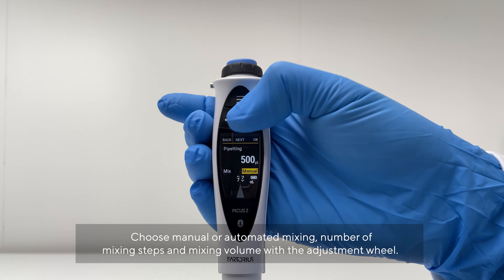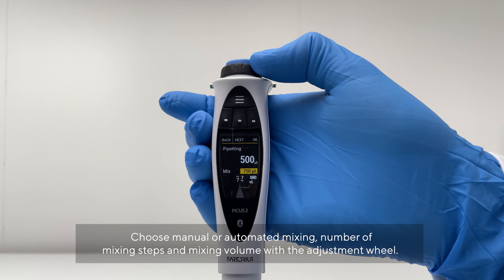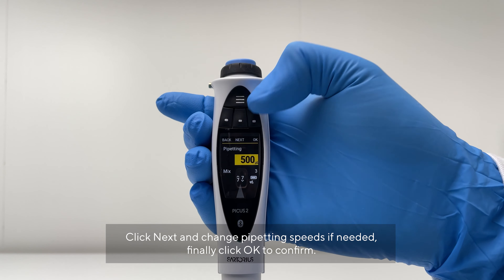Choose manual or automated mixing, the number of mixing steps, and mixing volume using the adjustment wheel. Click Next and change pipetting speeds if needed. Finally, click OK to confirm.